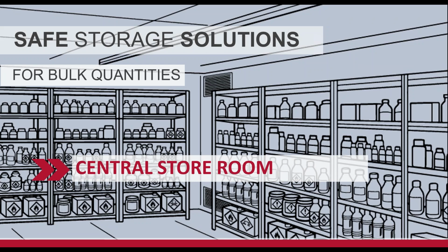Because in the laboratory space, we are not supposed to keep more than what we use in a day. That's kind of what the codes are written. Your country, my country, very similar, only daily use. Well, what does that mean? I can tell you as a chemist, what that means is I'm going to take whatever I need to the laboratory, I'm going to keep it there until it runs out, because I'm tasked with getting my task done. Nobody says you have extra time to go get it, and I'm not going to take it back. It just doesn't work that way. A lot of that has to do with training and then just the demands of the work. And some of it has to do with us scientist folks being a little bit OCD and ADD, and we're extremely focused on our task, as I mentioned earlier.